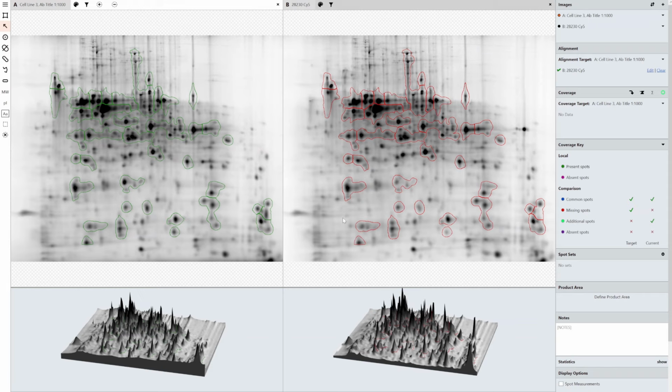It's all included within the project. It's all kept together. It's really neat. It's a really good way of adding notes to your experiment, or rather adding notes to your image. Now, if you see on the right-hand side here, we've got a separate, even larger notes box. And that is for notes, again, that will go into the report that are at more of a project level. So they may be things like the SOP, the operator, things like that.